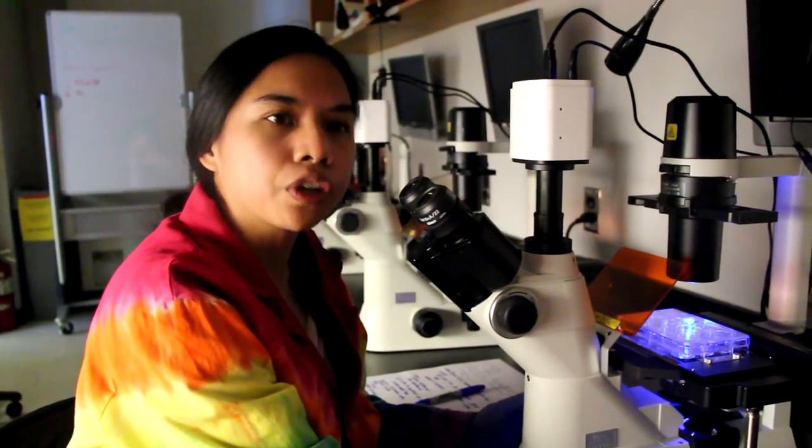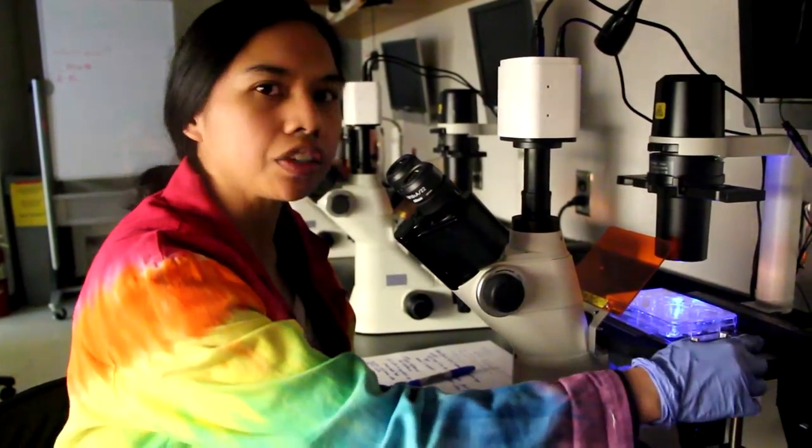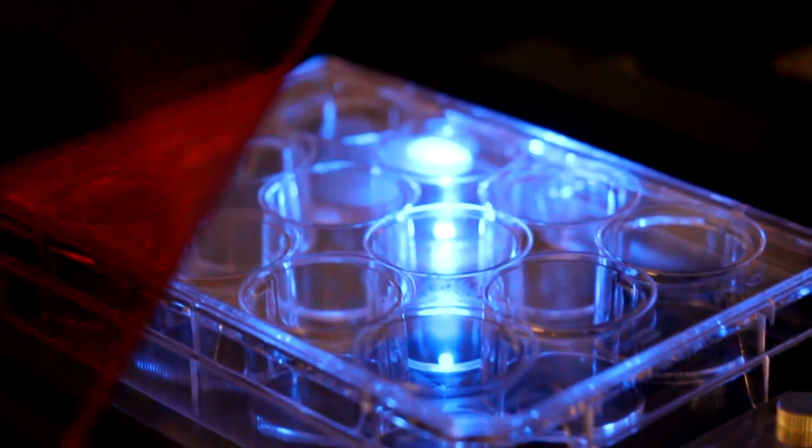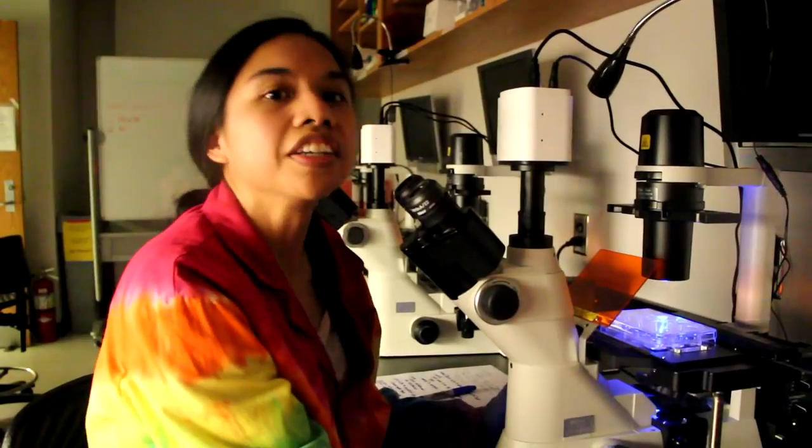In order to visualize green fluorescent proteins, we're going to need to use the cyan LED, or the C, on the light source. You can focus on your cells using the fine adjustment knob.